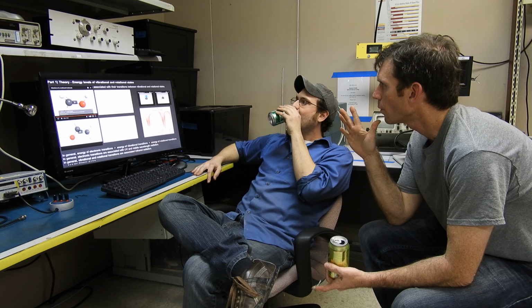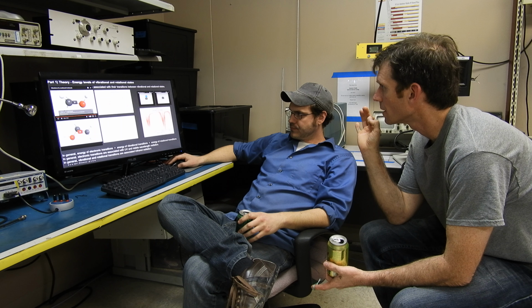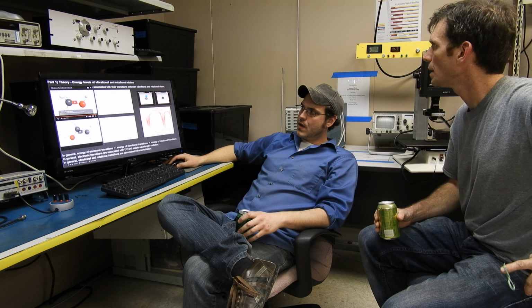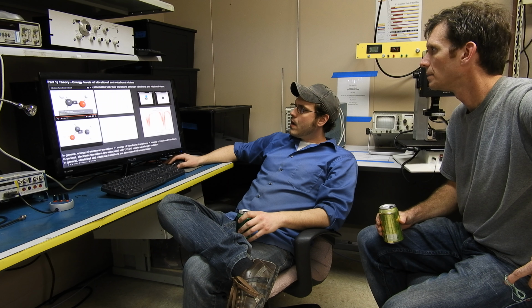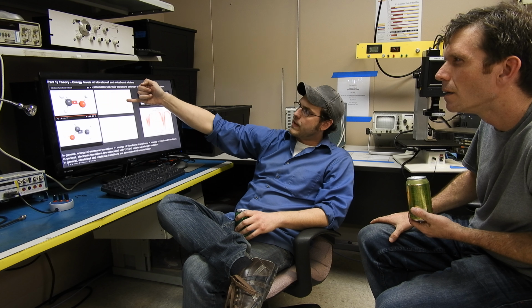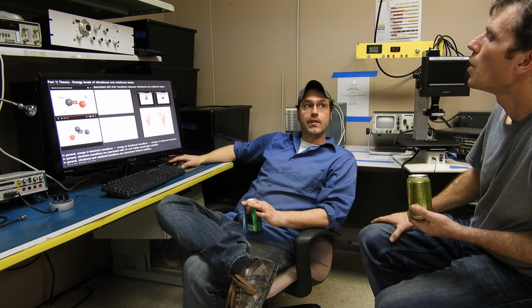Okay, so the red and black are protons and neutrons. The white are the electrons, right? Is that correct, or is it different atoms? Different atoms. The white are the hydrogen. Okay. So the size is representative of the atomic mass? Yes, atomic mass. All right. With infrared spectroscopy, we're able to see these transitions between these modes of the molecules. So this peak here will correspond to some kind of transition, and that's the basics of spectroscopy.